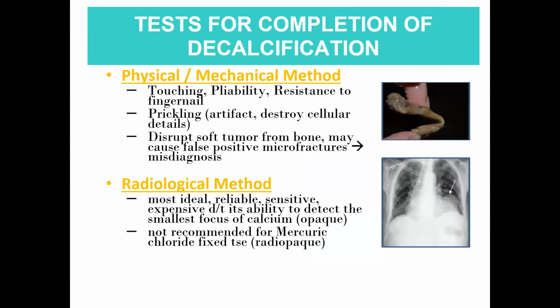You have different tests for completion of decalcification. First is the physical or mechanical method, the finger method: touching, pliability, and resistance to the fingernail. You can also do prickling. However, prickling or needling can produce artifacts which would destroy the cellular details and lead to misdiagnosis.